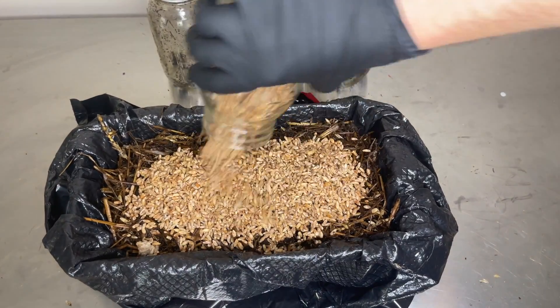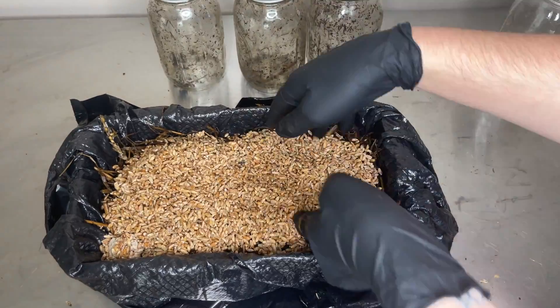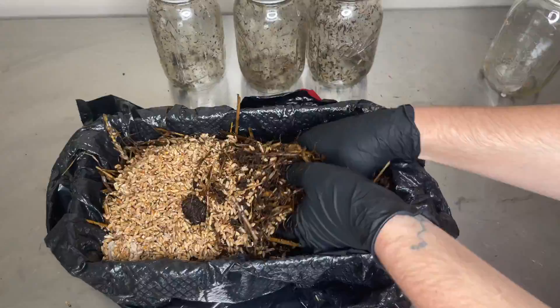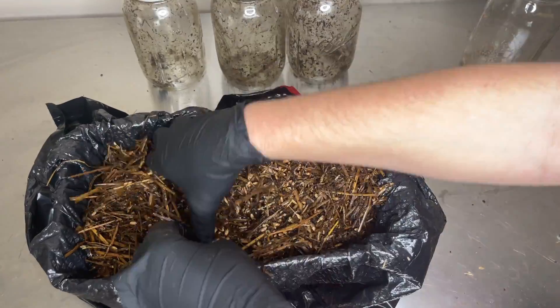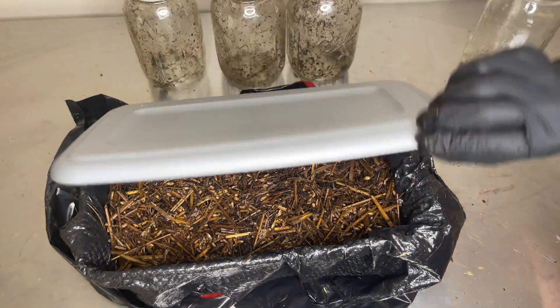After adding all 3 quart jars of substrate I add in the quart jar of colonized grain spawn. After the grain spawn has been mixed into the substrate I attach the lid and let it grow at 75 degrees Fahrenheit for 10 days.